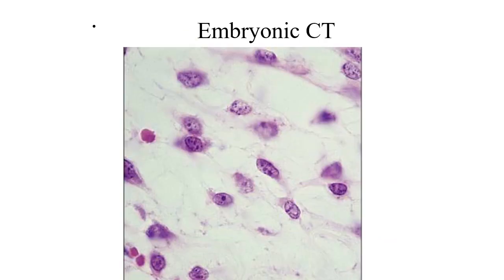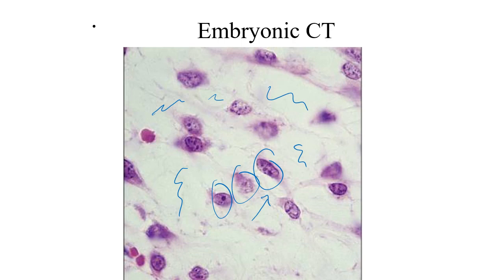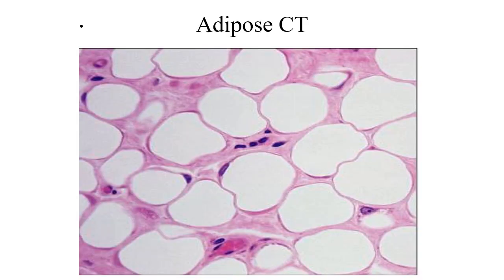Moving into connective tissues, one of the first things that we're going to look for are fibers. With connective tissues, we think of fibers rather than cells. And with those fibers, no matter what kind of connective tissue we're talking about, it began as embryonic connective tissue. And so it began as mesenchyme. And here we don't really have anything to note, really. There are some developing fibers inside. We've got lots of cells inside there. Lots of empty space in terms of the matrix that's inside there as well. And this is just the beginning stage. From here, it's going to differentiate into all our other connective tissues.